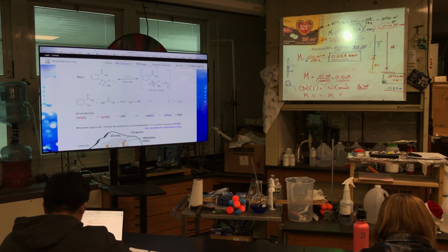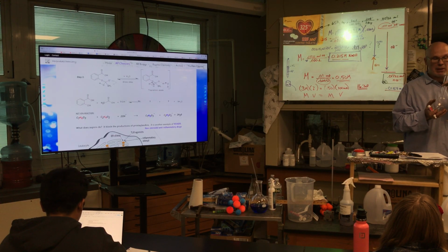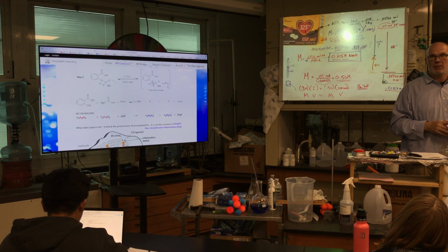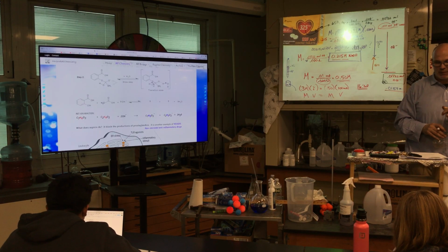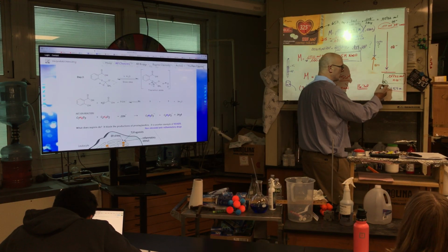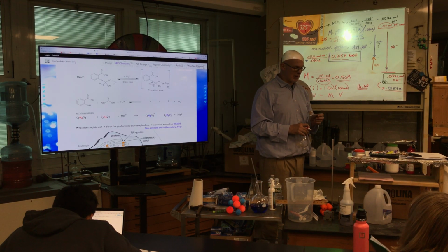Now your 100 milliliter, this is a 500. I'm gonna rinse out the beaker, get all the drips and drabs, and then I'm gonna dilute to the 100 milliliter mark. I'm not gonna use all of it, okay? I'll fill the burette up to 50 or something, and I'll have excess here because I just don't have any small enough of that. And that's the design, okay? But the biggest thing I want you to get from that is this arrow down is gonna change once we standardize. We set it up based upon the non-standard. Other class did not get that, hope you guys got that.